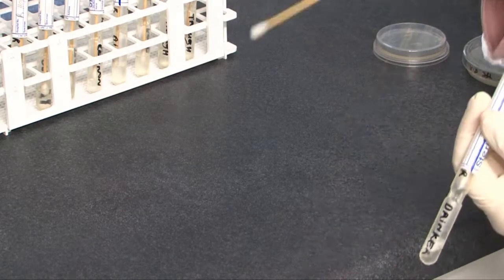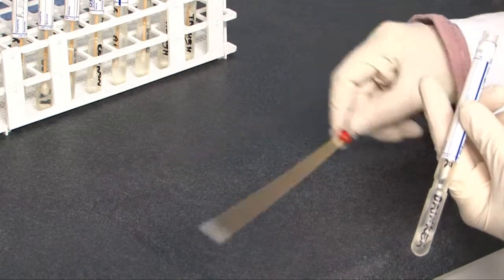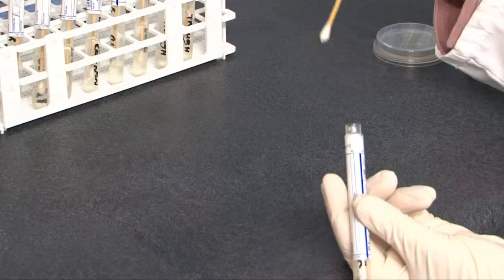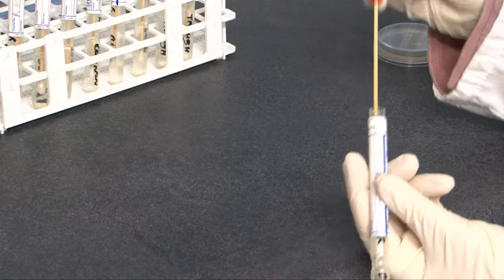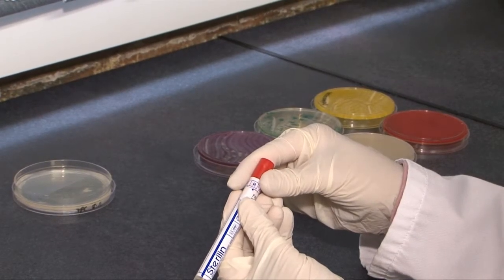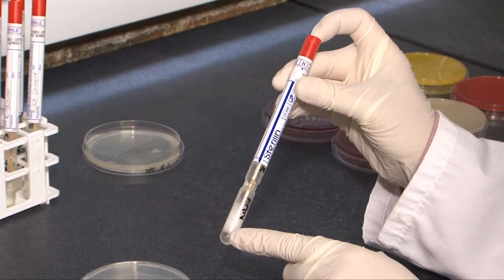Remove the swab from the tube, making sure you hold the plastic end. You then roll the end of the swab over roughly a 10 cm squared area, rotating the cotton tip as you go. Replace the cotton-tipped swab back into the tube containing the neutralizing media.